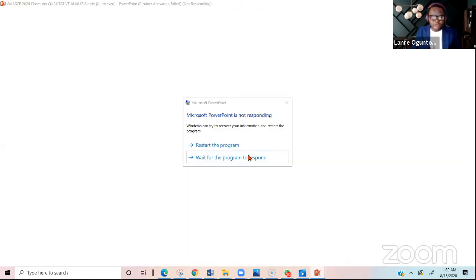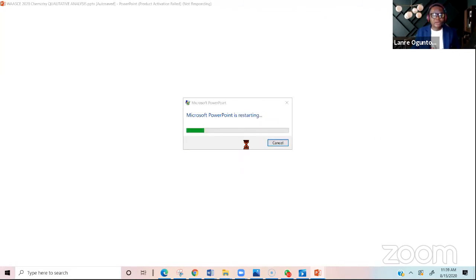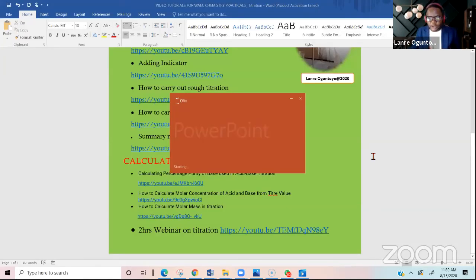Let me say that again. Your observation will be that the mixture dissolves in your alcohol, because iodine can dissolve in alcohol. So your mixture will dissolve in the alcohol. But you're not going to be writing alcohol, you're going to be using the word sample.